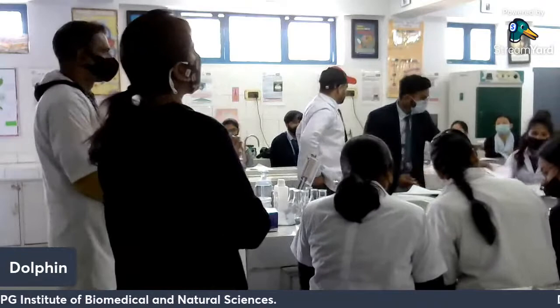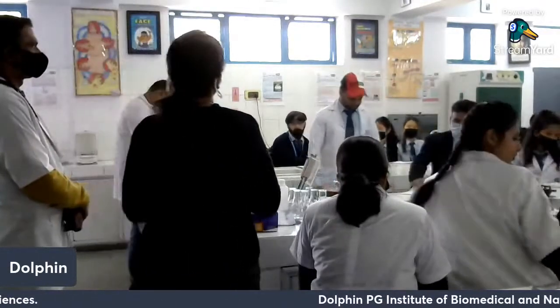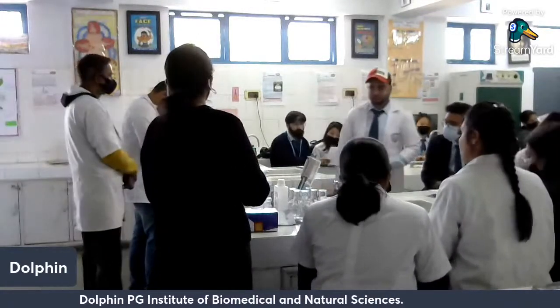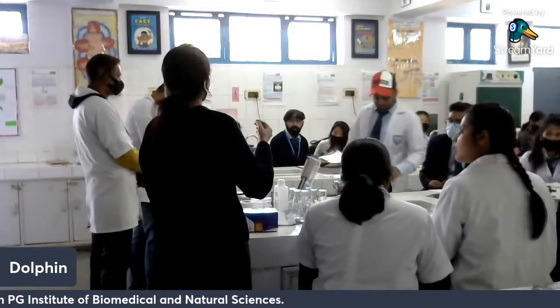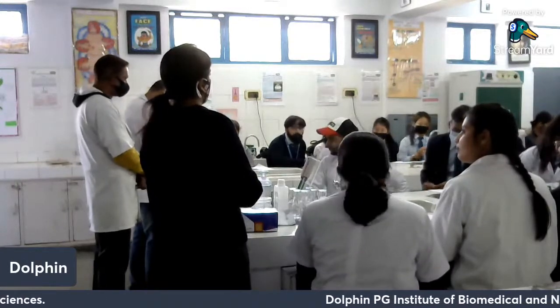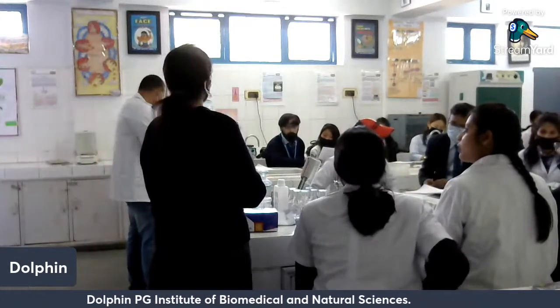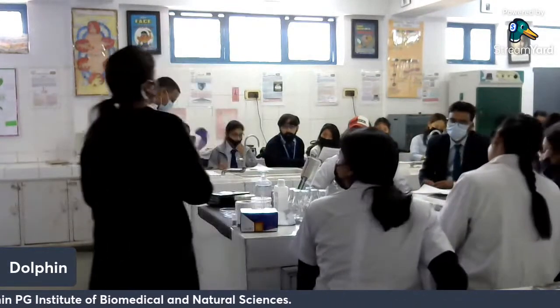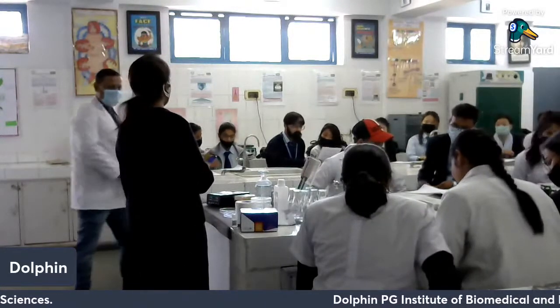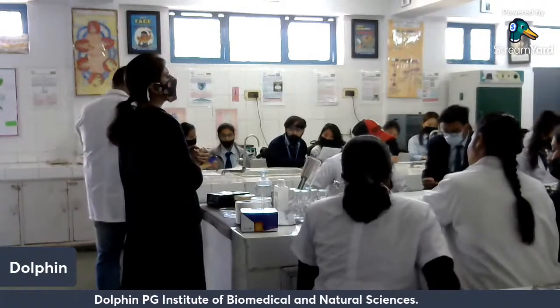First thing is we are making the buffer. The buffer given here is 10x. What is the meaning of 10x? It's 10 times concentrated, right? And we have to prepare the gel in 1x, so we need to dilute it. How do we make 10x into 1x? You take 1 ml of the 10x buffer and add 9 ml of sterile distilled water.